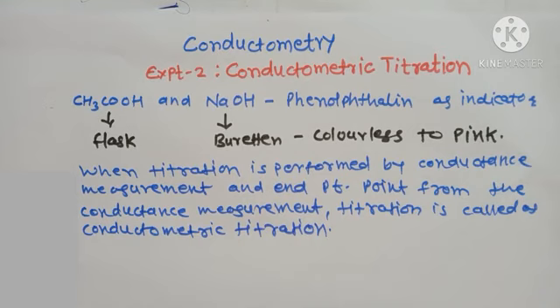So the titration is the same, only the methodology by which the endpoint is obtained is different, and here the endpoint is obtained from the conductance measurement.